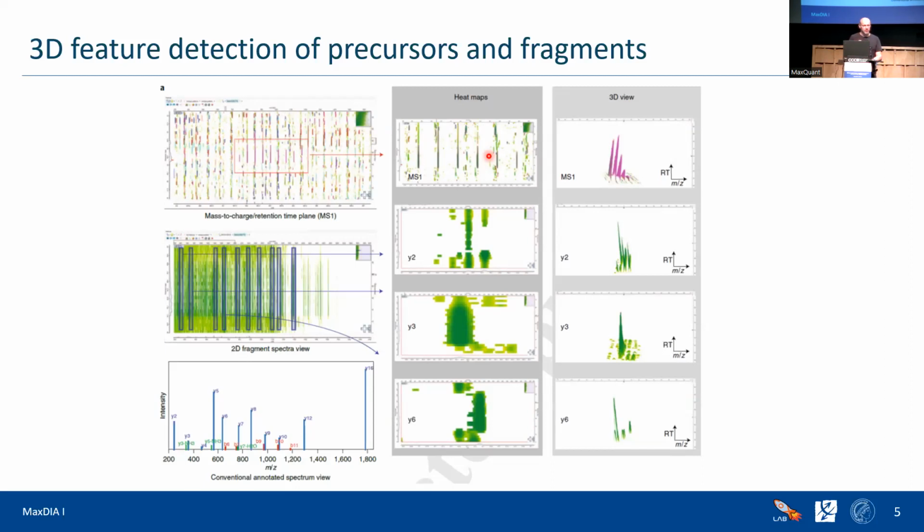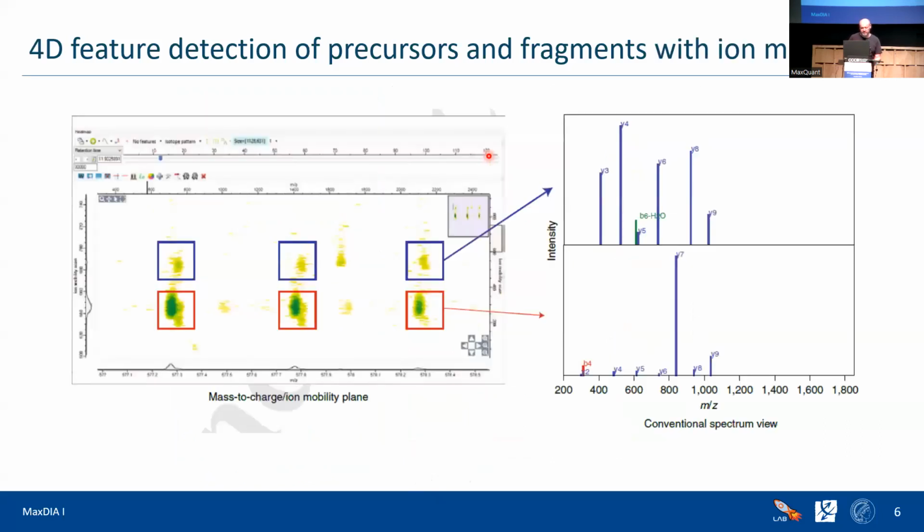That way you don't overinterpret the data by assigning data that is really connected by a feature, which you wouldn't know if you don't do feature detection, to multiple library spectra, which might be similar. But we get to this in more detail later.